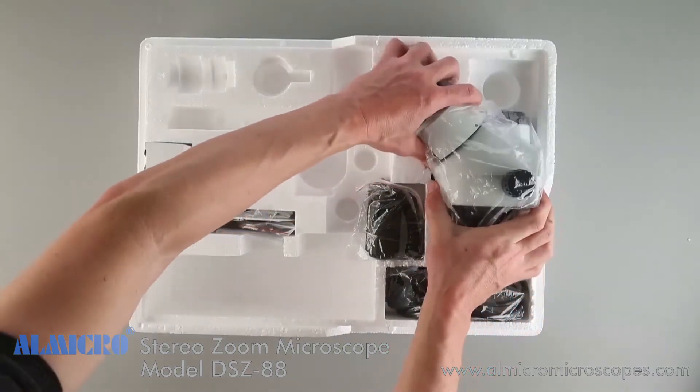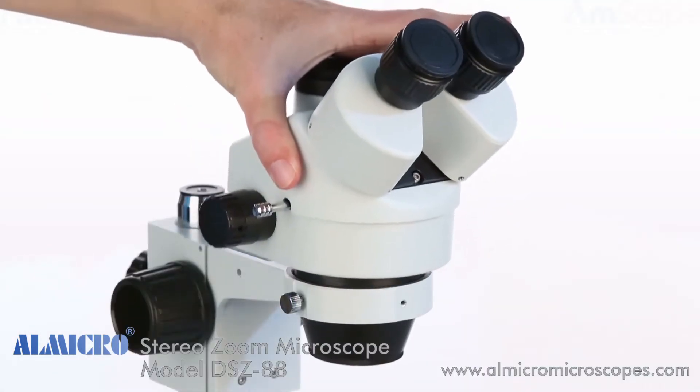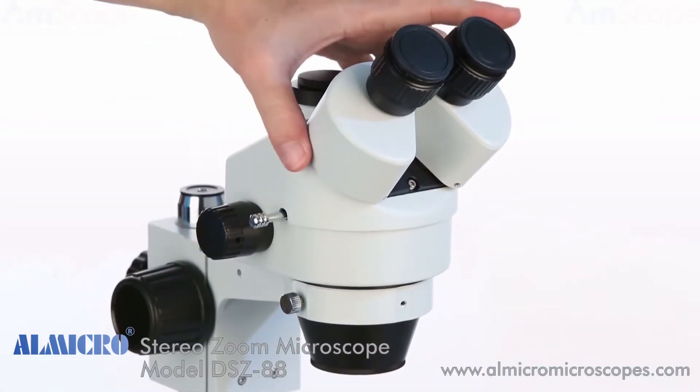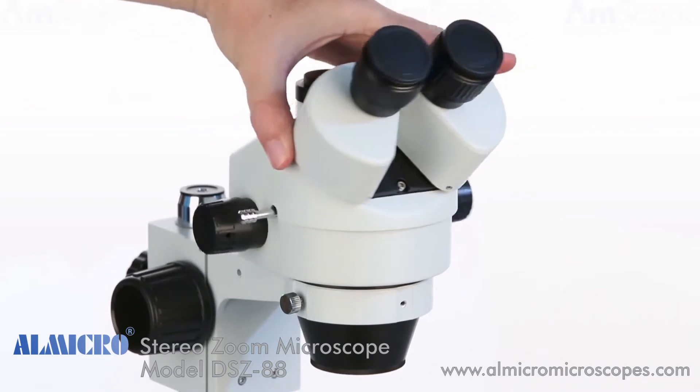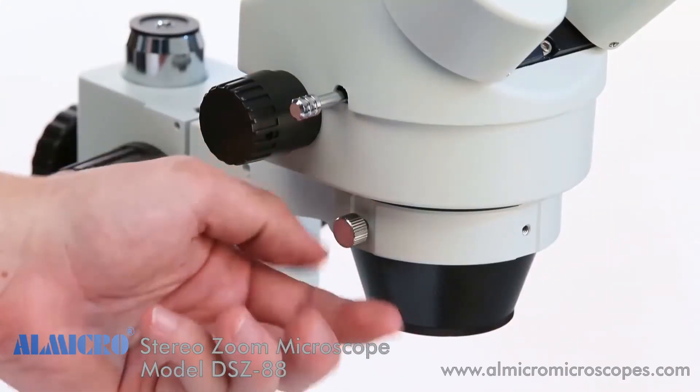Now let's install the head. Simply slip the head into the collar on the focusing rack. The head can be rotated to suit your working conditions. Once in position, secure it by turning the collar's locking screw.